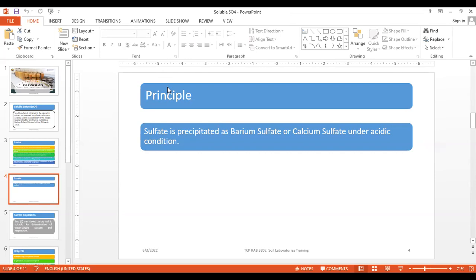But here you have to add some conditioner to keep the precipitate in suspension, so that it will not precipitate at the bottom of the crucible or flask. The salt will be kept within the solution, so it keeps homogeneity. So you have to add some conditioner. I discussed with Maria that we can follow this methodology since it is already adopted in practice in laboratories of Lebanon.